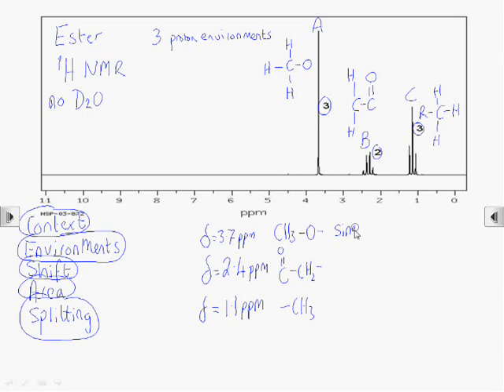Peak A is a singlet. So there's no carbon connected to the carbon with the hydrogens for peak A that has a hydrogen on it. So no hydrogen on an adjacent carbon. And that fits with an oxygen being connected to that carbon.